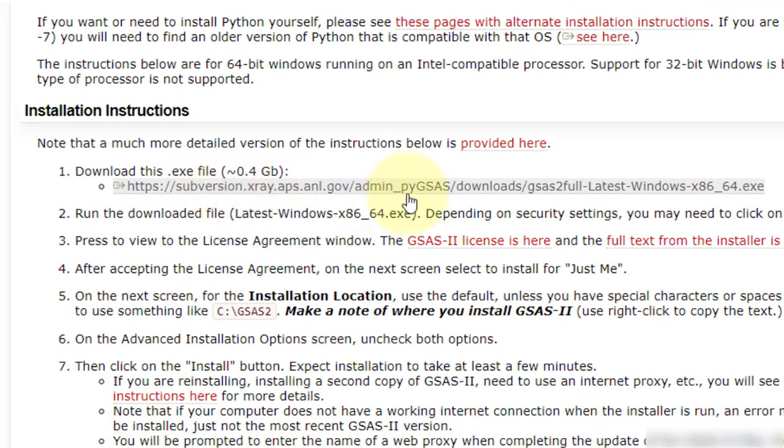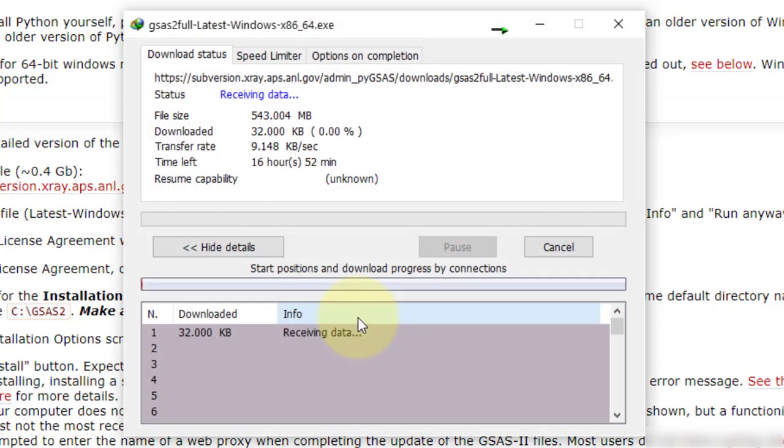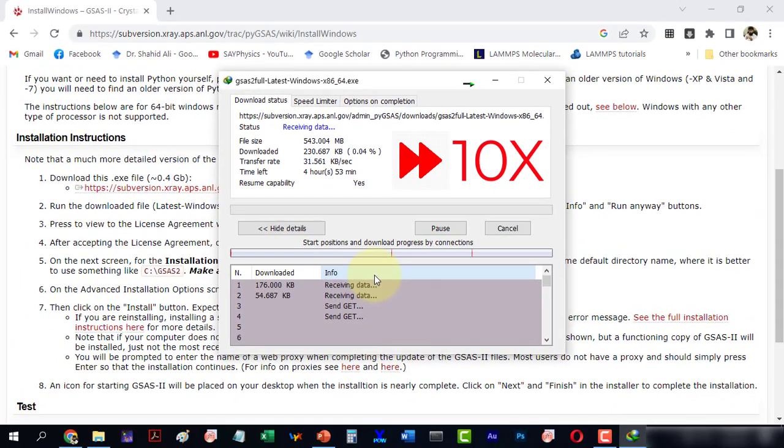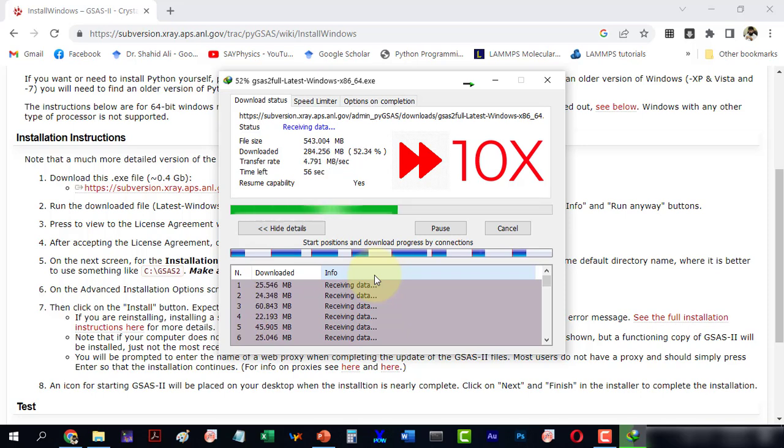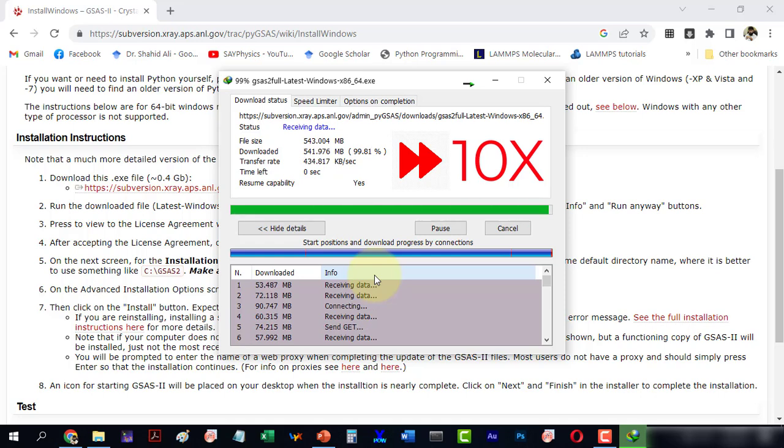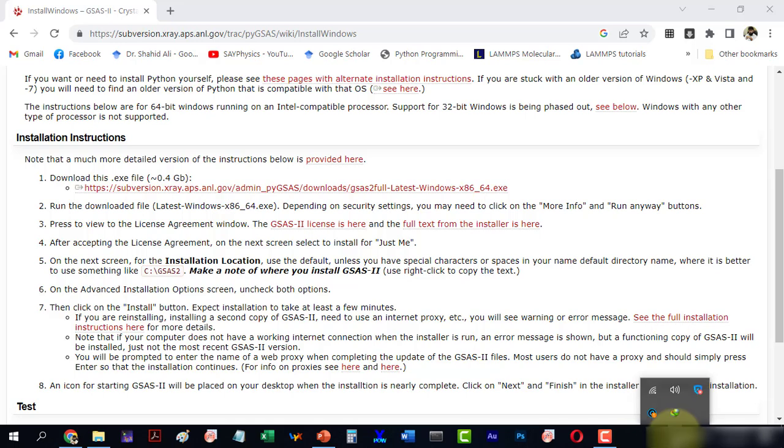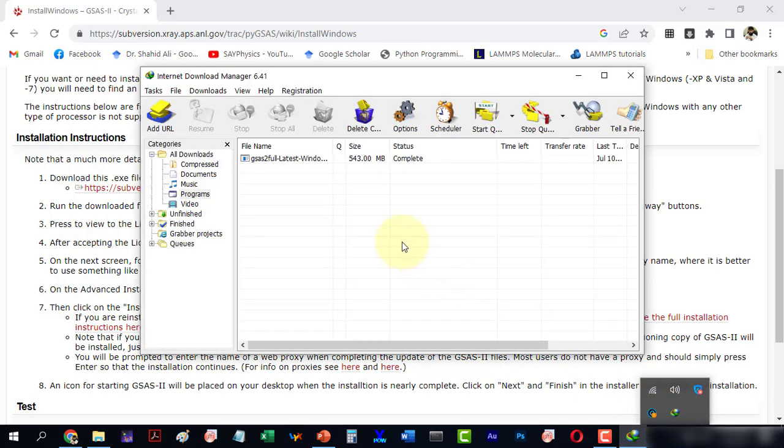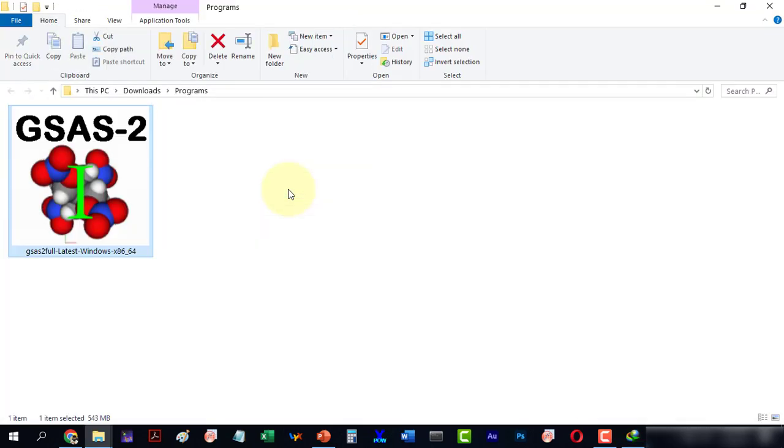First we will download the file which includes both the 64-bit and 32-bit versions. The file size is large, so I have fast-forwarded the video by 10 times to save time. Go to the download manager where the file is located. Here is the executable file which is 543 MB.